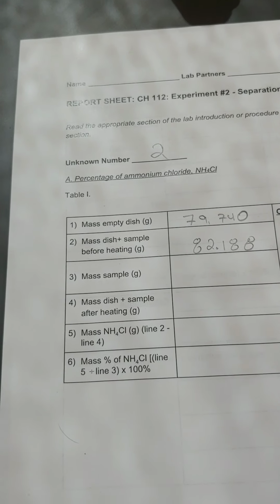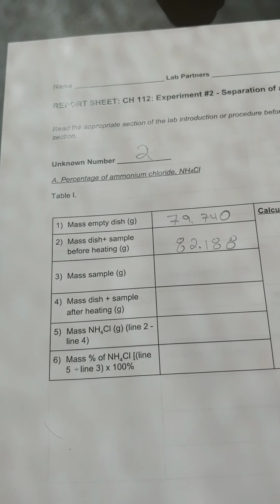So now I'm going to take the sample into the fume hood and begin to heat it up so that I can start subliming off the ammonium chloride. That step we have to do in the fume hood because the ammonium vapors are not something we would want to be breathing in. So we're going to do that in the fume hood so that it goes up through the exhaust system and not out into the lab. I'll walk over to the fume hood, we'll get that sample set up, and then we're going to start to heat it up.